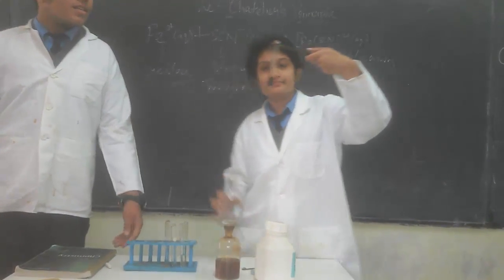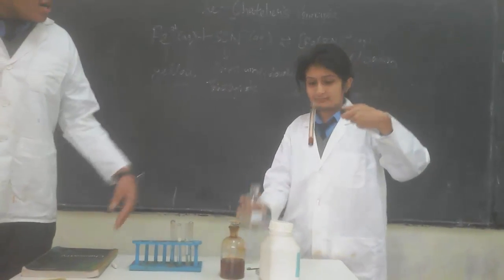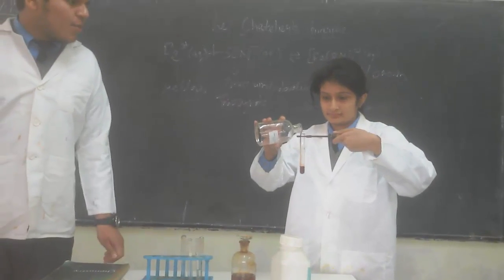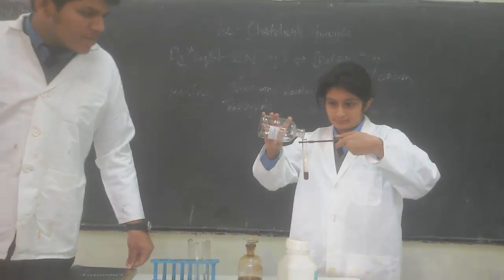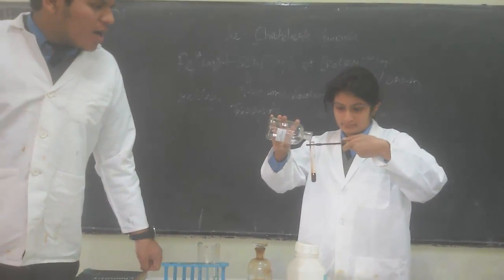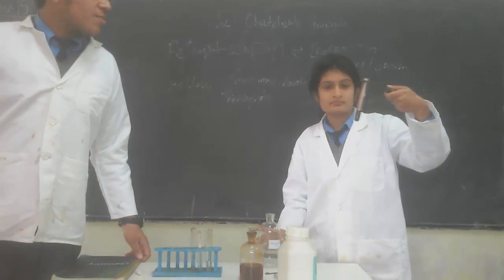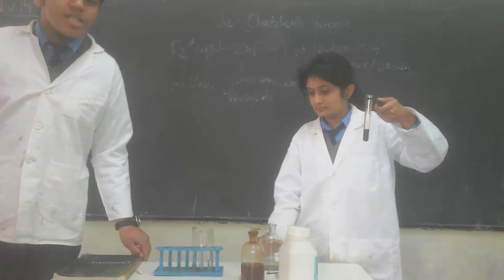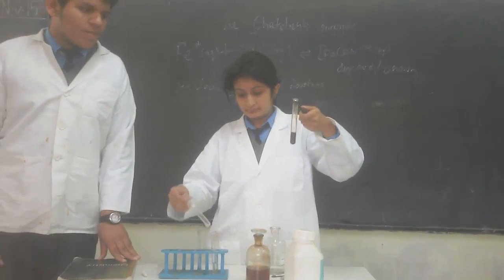Now we are going to see the deep red coloration. If we add more then the intensity will increase. Now after some time the deep red coloration becomes constant. This indicates that the reaction has reached equilibrium.